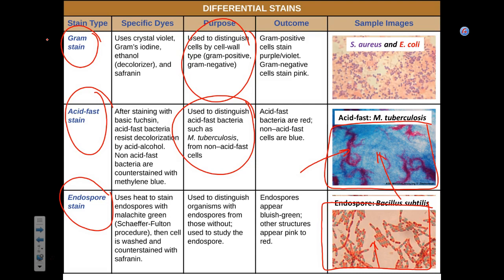That's it. If they are Gram-positive and they make endospores, that's either Bacillus or Clostridium. And if you're in the hospital and you have Clostridium, and it's a lot of it, and the patient has diarrhea, that's C. diff. Does that make sense? So this, you don't really have to do sophisticated analysis anymore. Okay, you're done. It can be done pretty fast. Clostridia is a little bit more complicated because they are anaerobes, but kind of leave it behind.